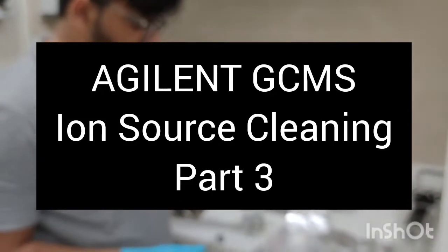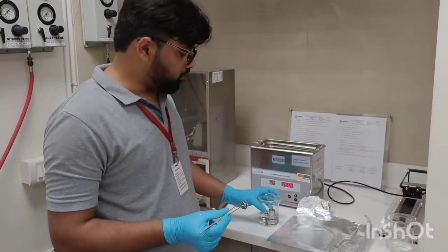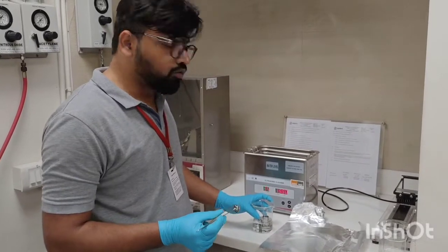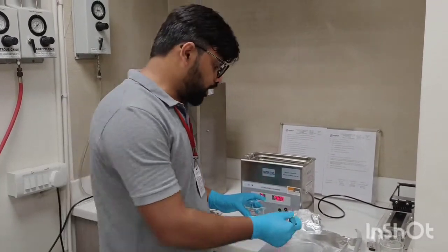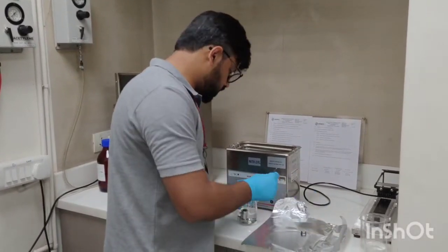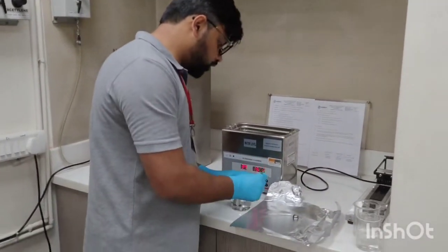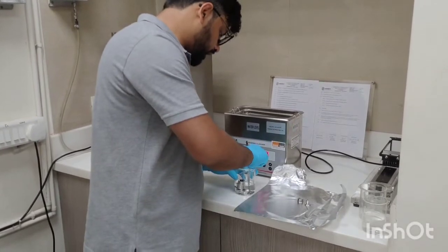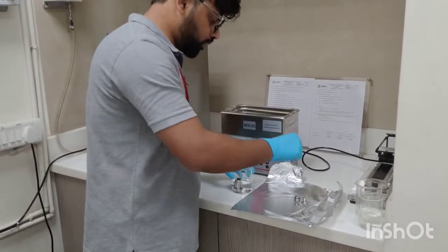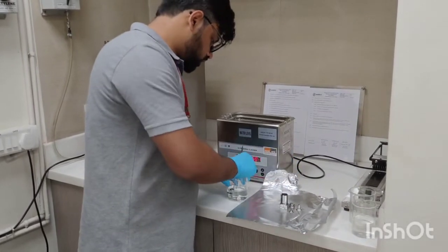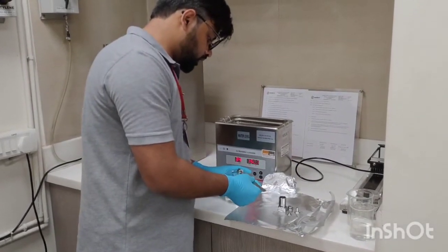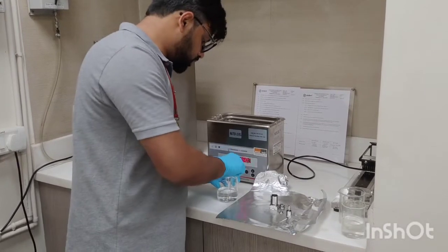We have sonicated all these parts in three different solvents. Initially we did the sonication with acetone, followed by hexane, and finally we have sonicated with methanol. We are doing this cleaning and sonication with different solvents so that we remove all the impurities, different polarity impurities which are present. After sonication we place all these parts on aluminum foil.